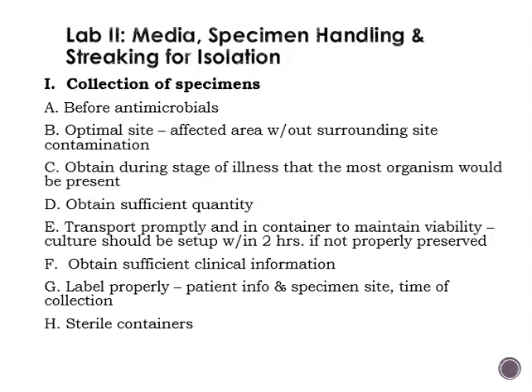Now we're going to talk a little bit about microbiology, media, how specimens need to be handled, and streaking for isolation. So when we're talking about collection of specimens, we want to talk about criteria for good collection. So some of those criteria are laid out here.